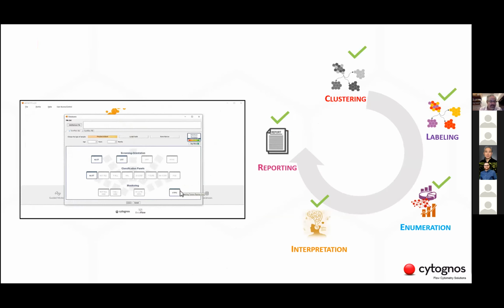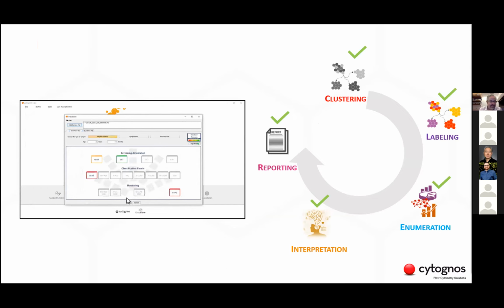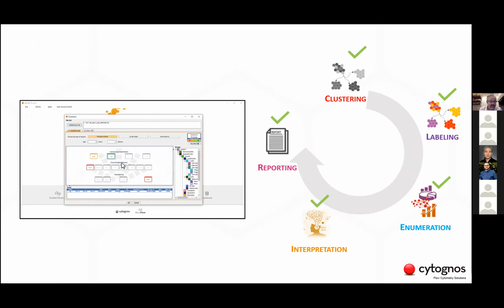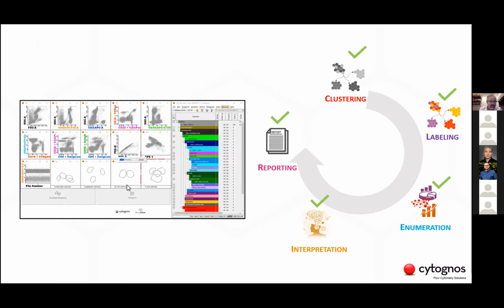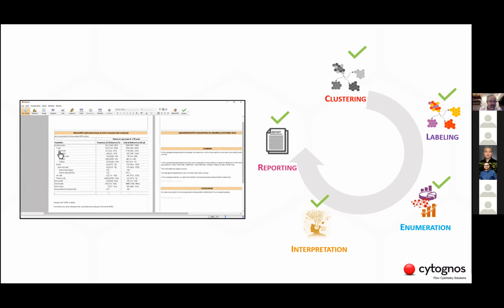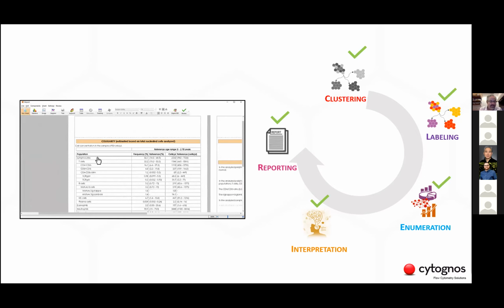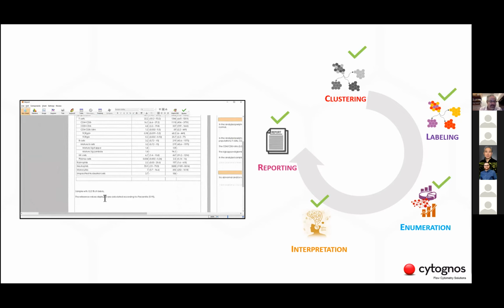And that process of clustering and labeling automatically is actually used together with tools for automated statistical analysis of the findings, and quality control of the samples. For example, we can teach the software to identify contamination of a bone marrow sample with peripheral blood, or to identify that some population is missing because of a reagent problem, something like that.